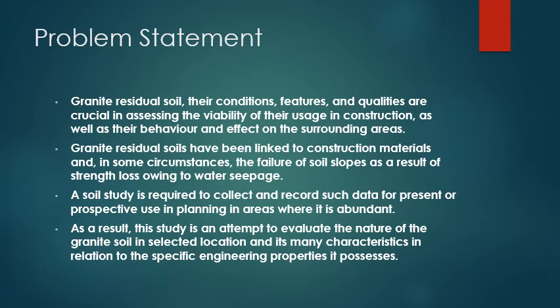Problem statement. Granite residual soil, its condition, features and qualities are crucial in assessing the viability of its usage in construction, as well as its behavior and effect on the surrounding areas. Granite residual soils have been linked to many construction materials, and in some circumstances the failure of soil slopes as a result of strength loss owing to water seepage. Soil study is required to collect and record such data for present or prospective use in planning in areas where it is abundant. As a result, the study is an attempt to evaluate the nature of the granite soil in a selected location and its many characteristics in relation to the specific engineering properties it possesses.